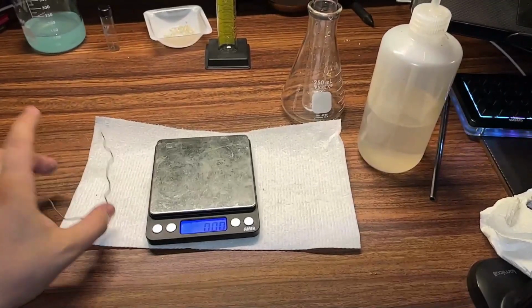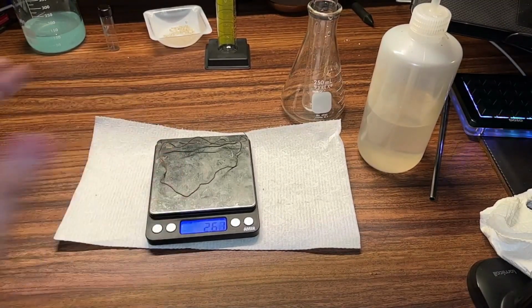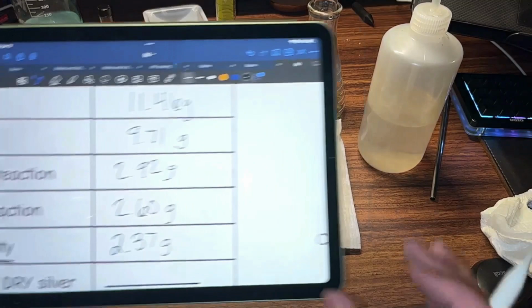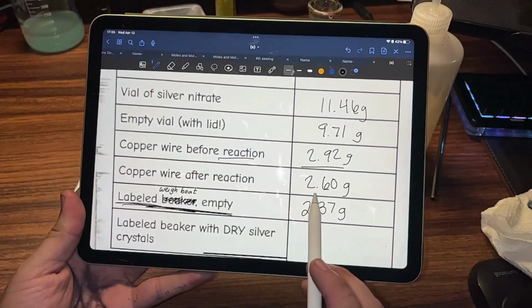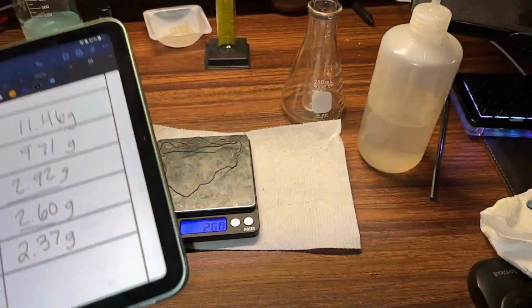That's better, okay. The mass of our copper after our reaction is 2.60 grams. So that's a fair amount of copper that we used, right? Because before the reaction, it was 2.92. After the reaction, 2.60.